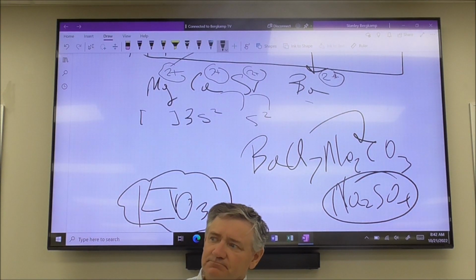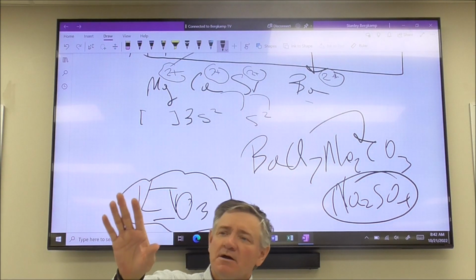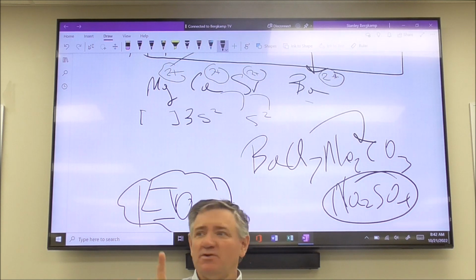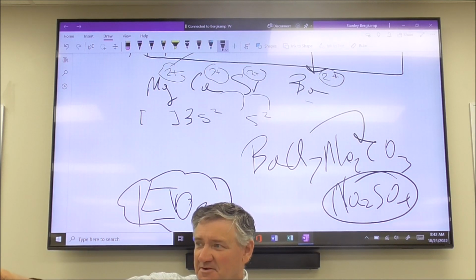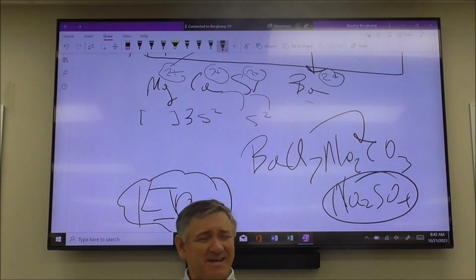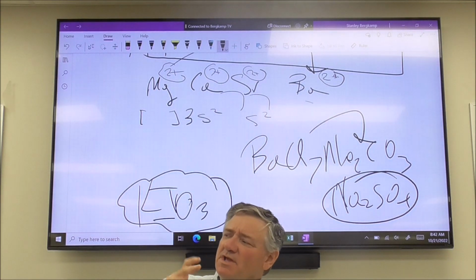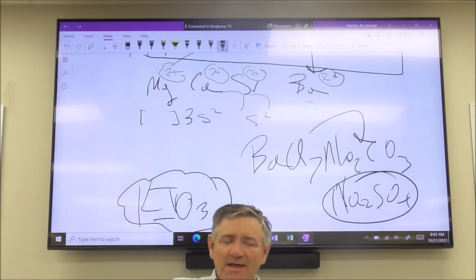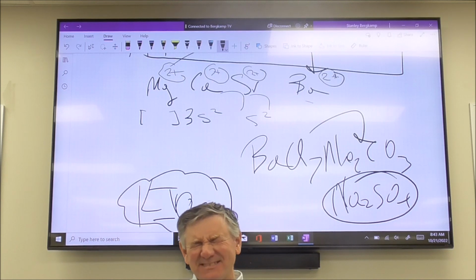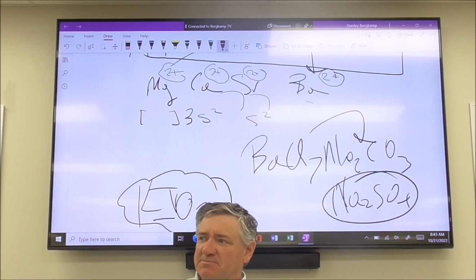Now the magnesium was attracted to it, but not so much, okay? How many precipitates did magnesium form? One. And even then, on your dot scale, one dot wasn't much, was it? So it kind of formed a precipitate, but it was only one dot. So even the one that magnesium did form a precipitate with, that's just okay, not a whole lot. It made some, barely out of the friend zone, but not much. Whereas the barium's going, hello, boom, we're gonna make it precipitate.